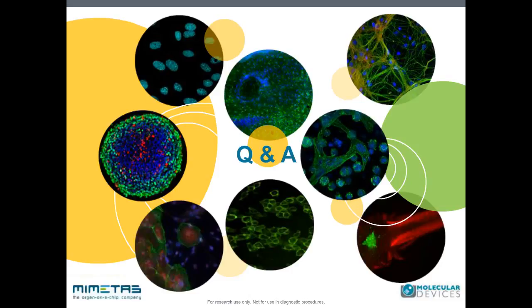If it's about a higher level quantification or higher level analysis, you really need to take the confocal stacks and do a 3D representation of the full culture. There the imaging usually takes anything between a couple of minutes to 10 minutes per individual well, depending on the optical resolution of the Z-stack. For flat imaging, like you answered before, it can be really quick. We can do a full plate in less than 5 minutes if necessary.